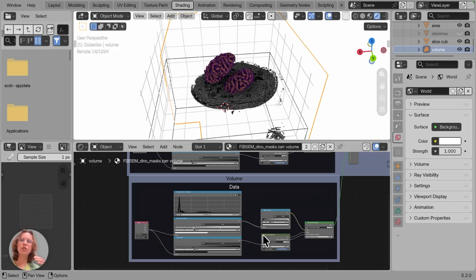So this allows us to, within EM data, show both the data and our segmented regions in the same view without having to go to surfaces. Because often in EM data people only show a surface render, and then you lose all of this context of what the pixel values in those regions actually are.